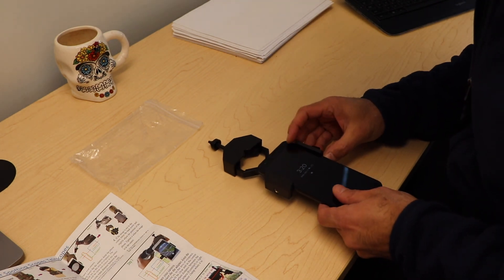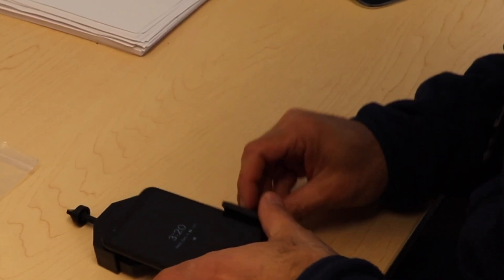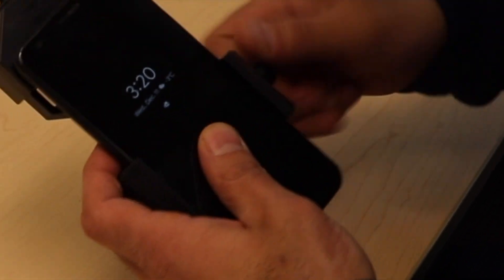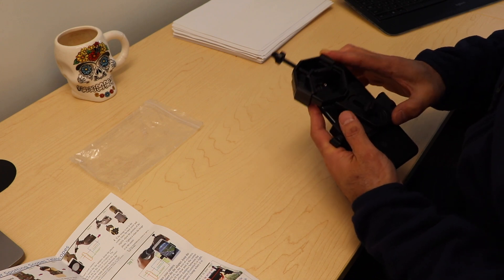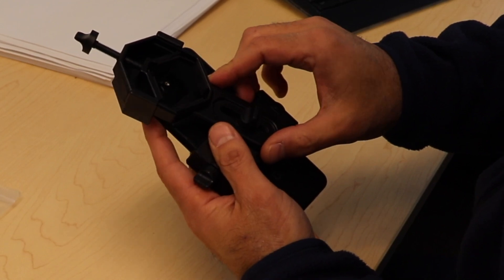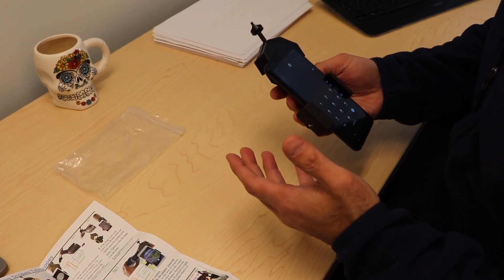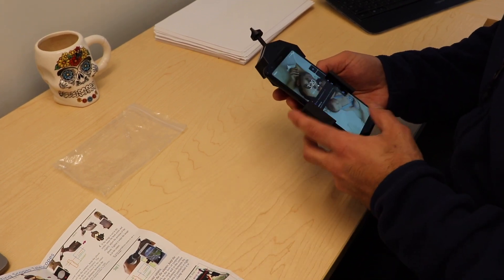It adjusts to fit just about any phone. Here we're installing the phone, lining up the camera so it peers directly into the eyepiece of the microscope, allowing us to look into the microscopic world just as we normally would.